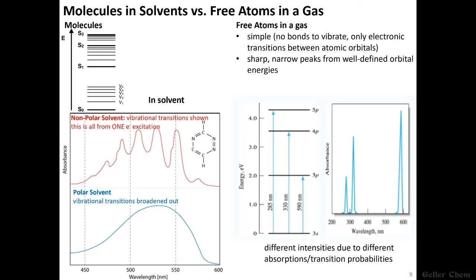Now it's time to discuss the advantages of using this type of equipment. And we're going to contrast what it's like to measure molecules and solvents, which is what we've been focused on, versus free atoms in a gas phase. So first, let's direct our attention to molecules. All of this should be a review for you.